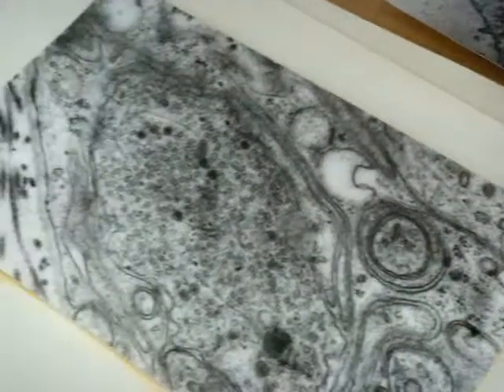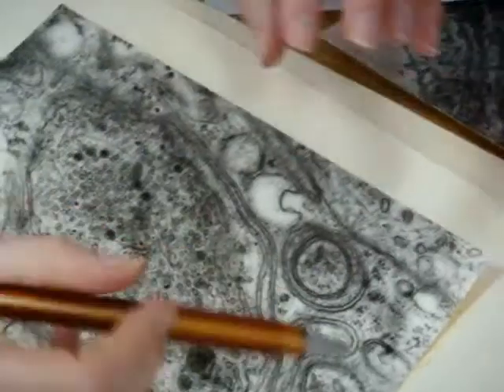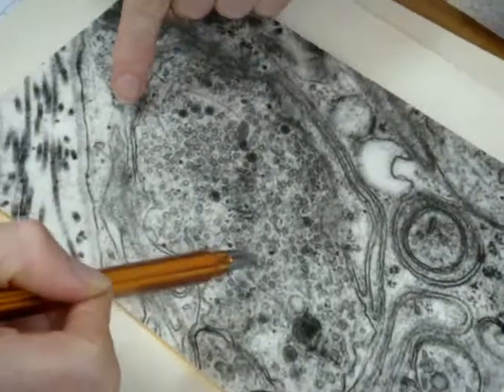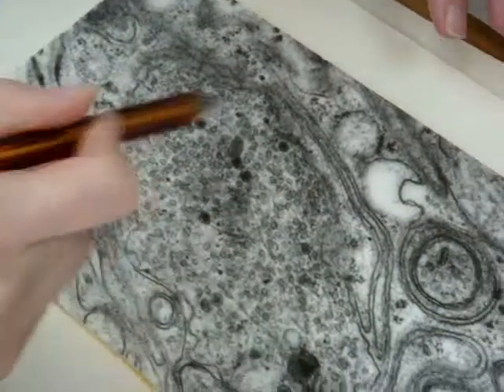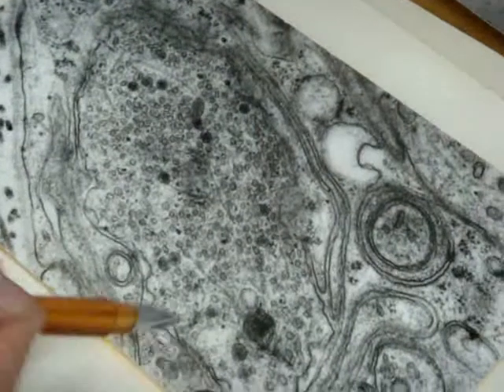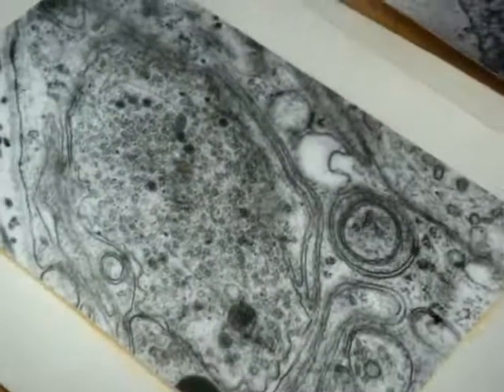These electron micrographs demonstrate for you the terminal of a nerve process where we can find mediator transmitter, transparent and with dense core. In this nervous process, we can't see formation of a classic synapse, maybe that will be later. Only storage of mediator. Maybe in the next section we can see the structure of synapse.